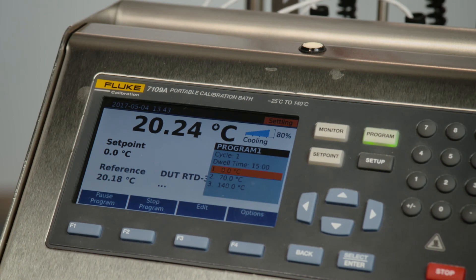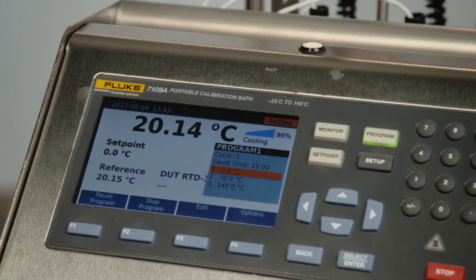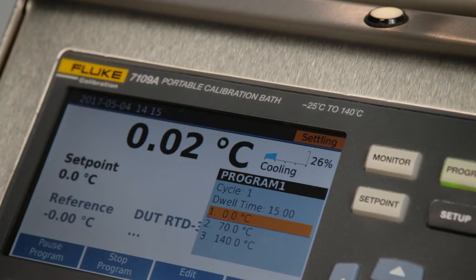On the display, you'll see the date and time, bath set point, and reference probe temperatures. The upper right-hand corner of the display includes control indicator and heating or cooling status. The control indicator will show stable when the bath fluid is at the set point and ready for temperature measurement. A ready indicator on the top of the bath changes from amber to green when the bath has stabilized at the set point temperature, indicating that the bath is ready for you to collect data.